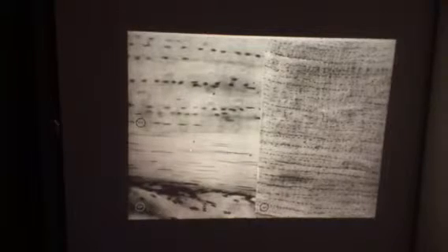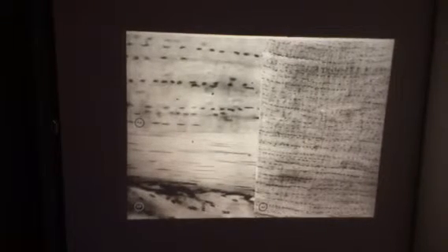How about this tissue right here? Now I should apologize, this is a different stain, but that shouldn't make any difference. But what is that? Dense, irregular connective tissue, and in here we have loose connective tissue. How about this tissue? Right there, right there, right there. What is this? Dense, regular connective tissue. And this would be what? White fat, unilocular adipose tissue.